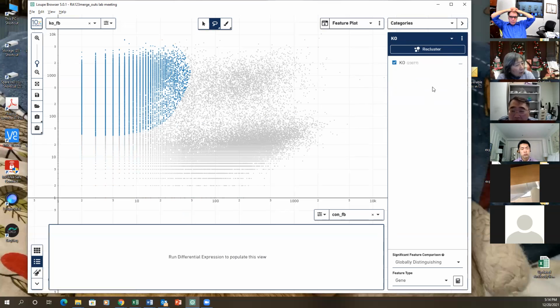You just need to gate the population again. You just gate the same gate, knockout. You gate again, same gate setup. Just draw the gating again. You see the blue color?